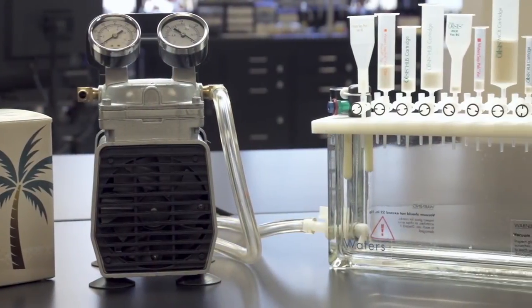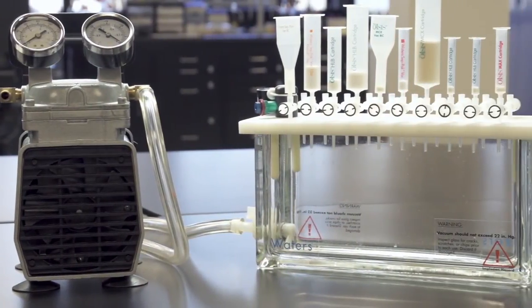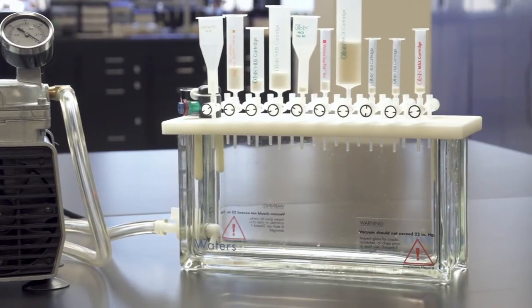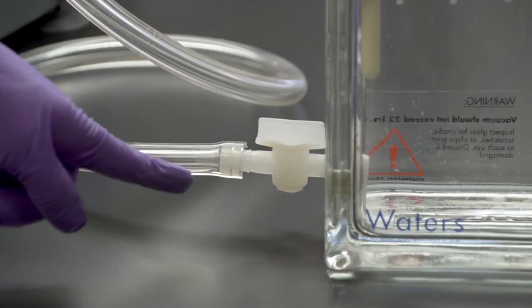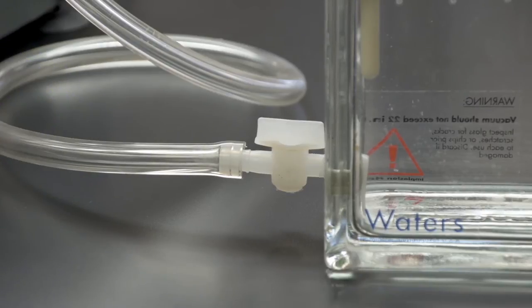This short 2-minute video will demonstrate the correct setup and usage of the 20-position cartridge manifold. First, connect the hose from the regulated vacuum source to the 20-position extraction cartridge manifold.